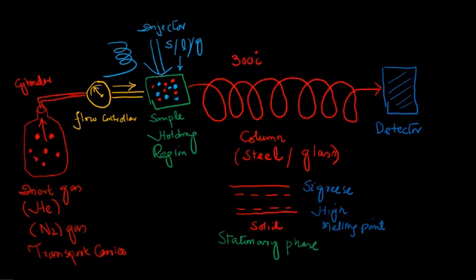After that, the detector will transfer the whole information to a region known as the computer analysis system, which will interpret the information received from the detector.